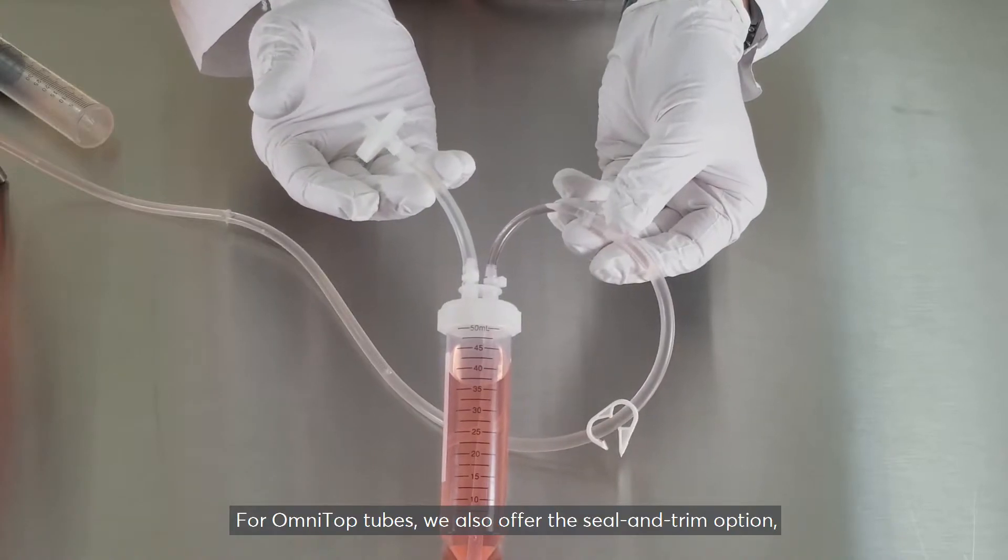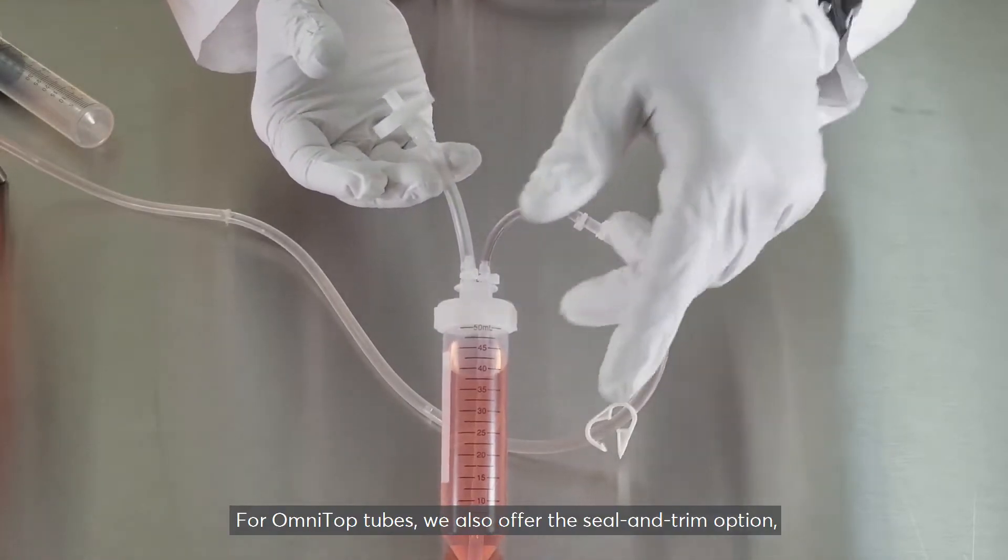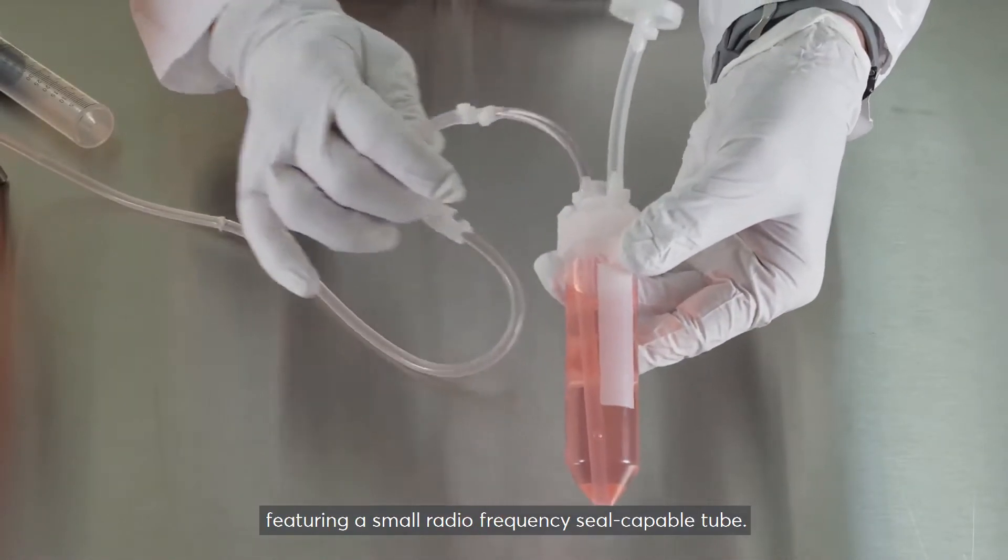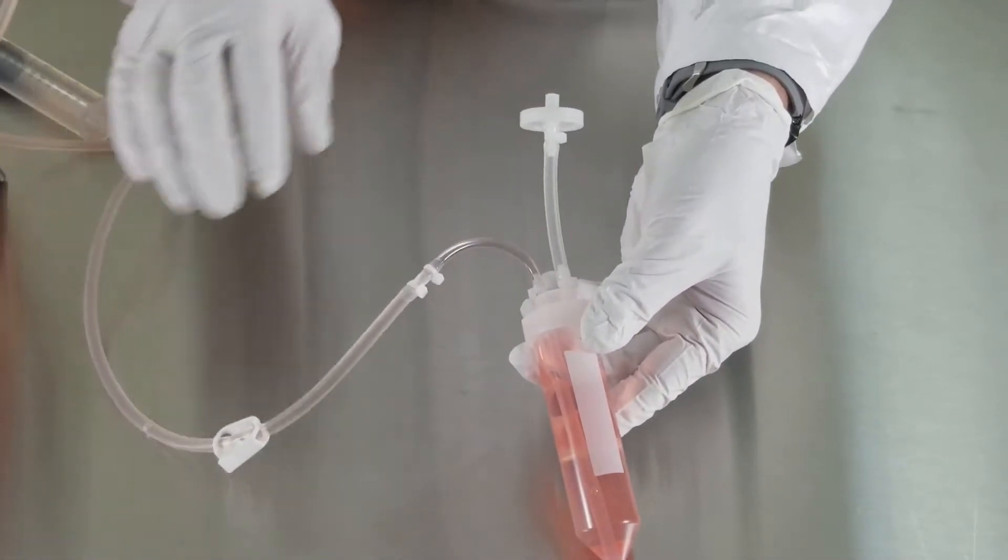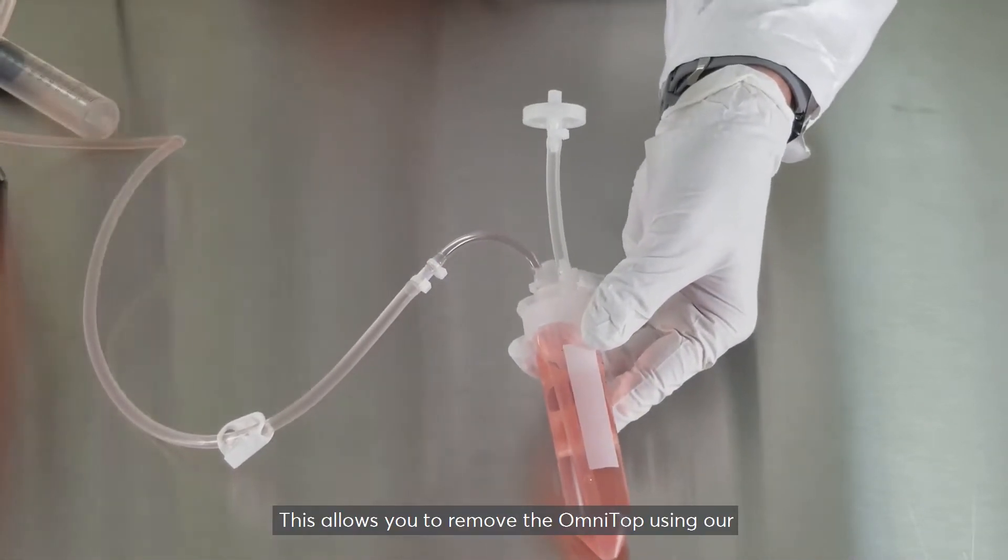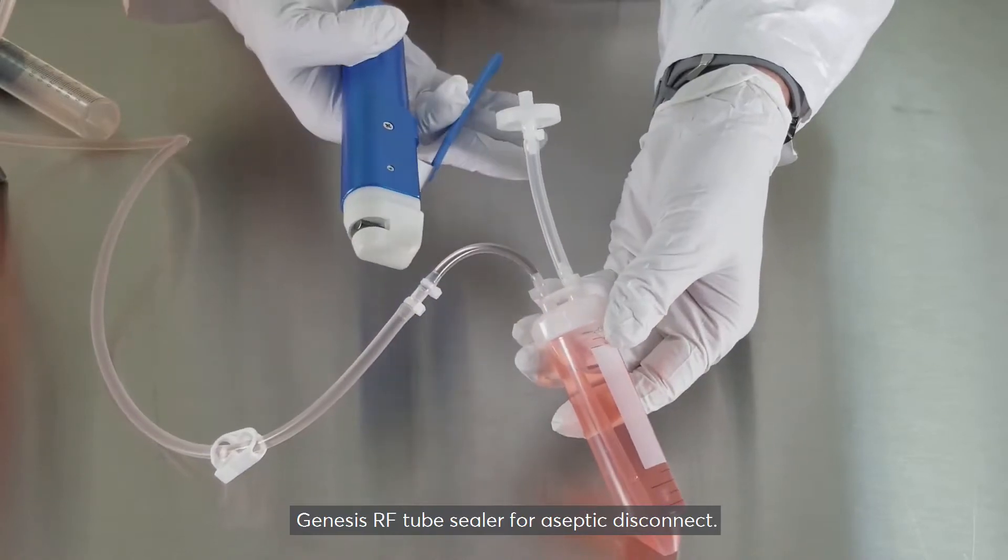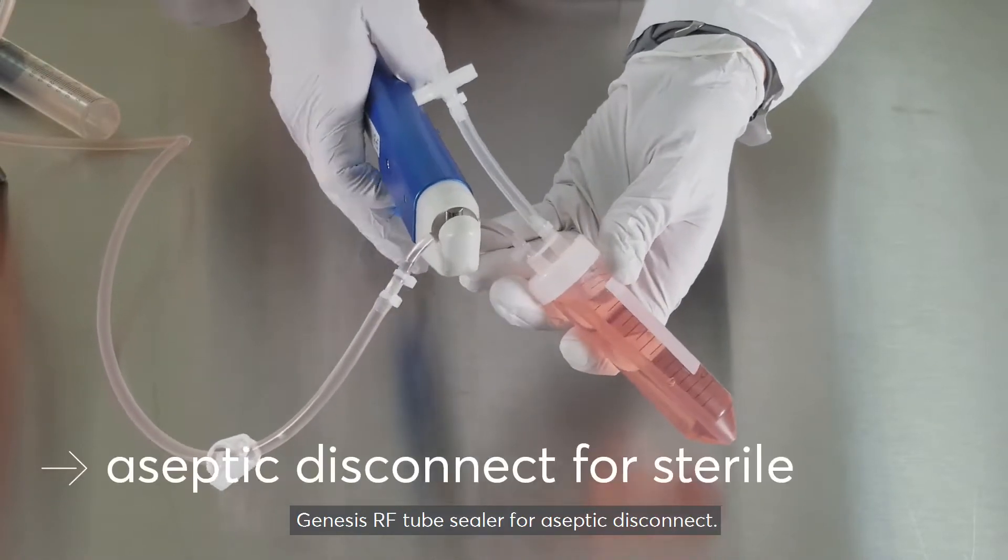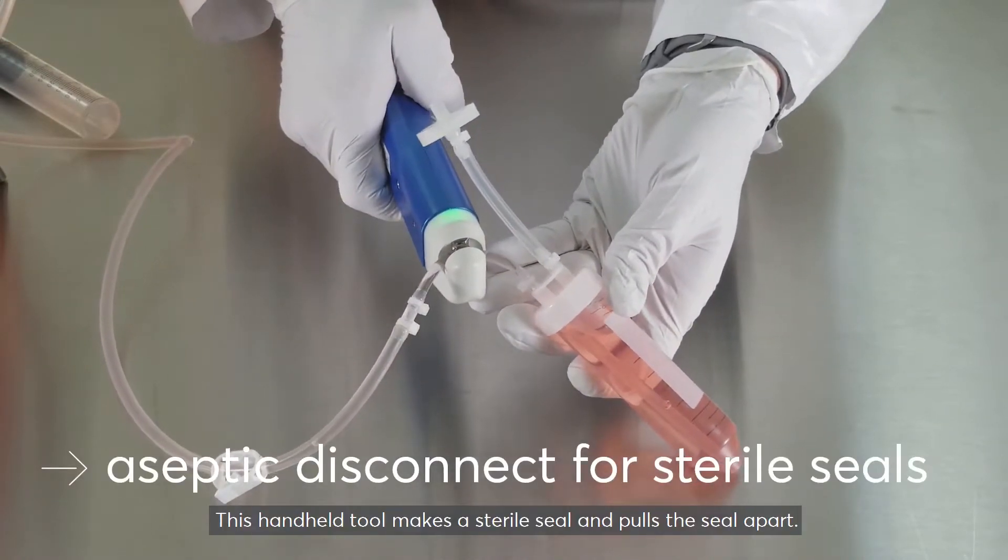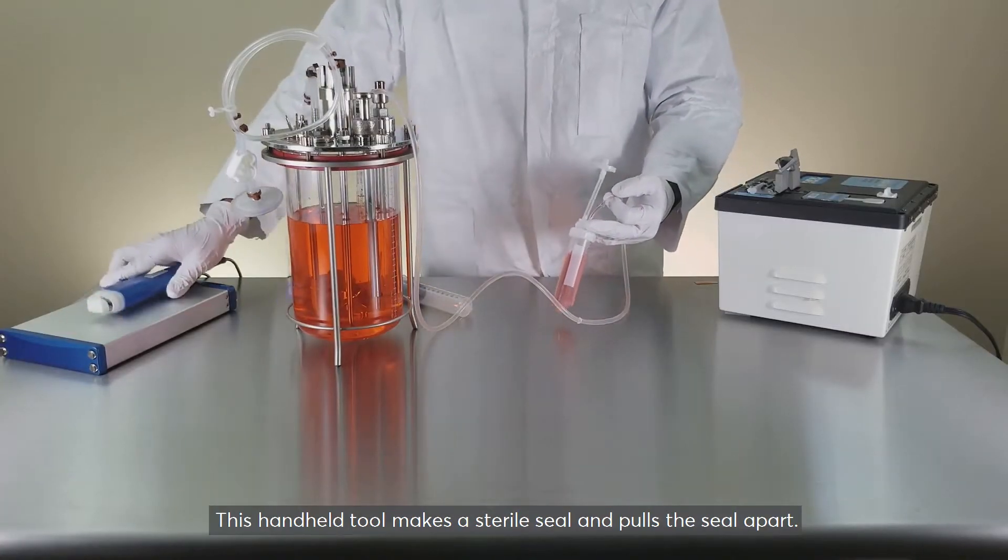For OmniTop tubes, we also offer the seal and trim option, featuring a small radio frequency seal capable tube. This allows you to remove the OmniTop using our Genesis RF tube sealer for aseptic disconnect. This handheld tool makes a sterile seal and pulls the seal apart.